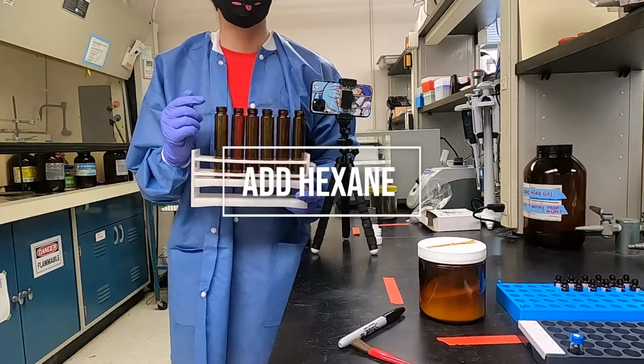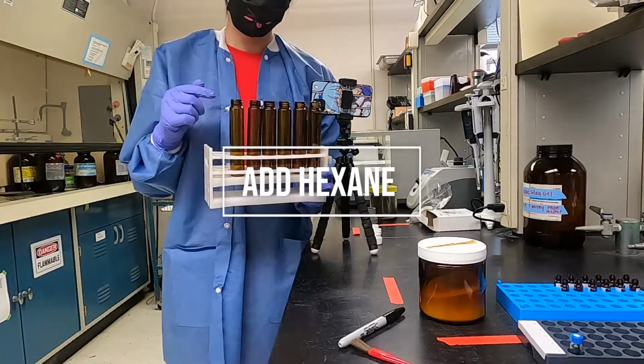And the next step is to add 2 ml of hexane into each of the vials.